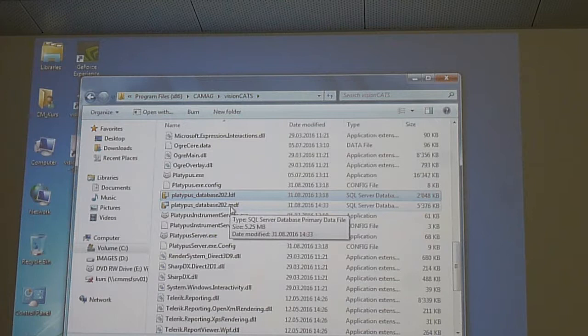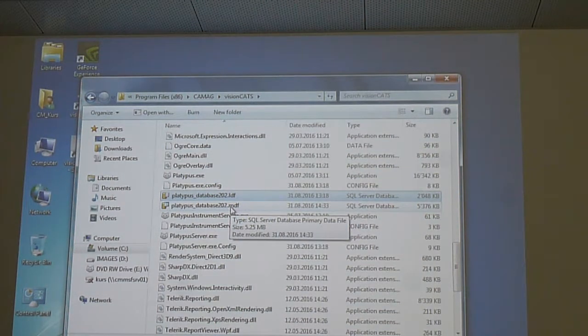If I delete these files now like that, we literally would have to restore the PC somehow. The thing is that if SQL Server sees that there should be a database, but there is no database, at the uninstalling it gives an error: I can't uninstall because I can't delete the database I made.